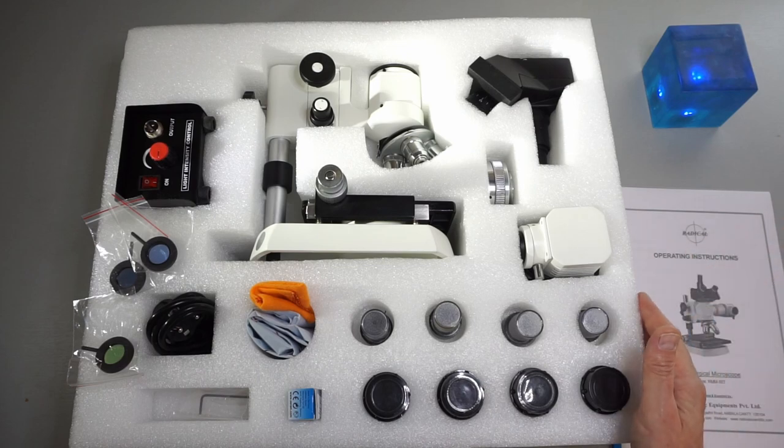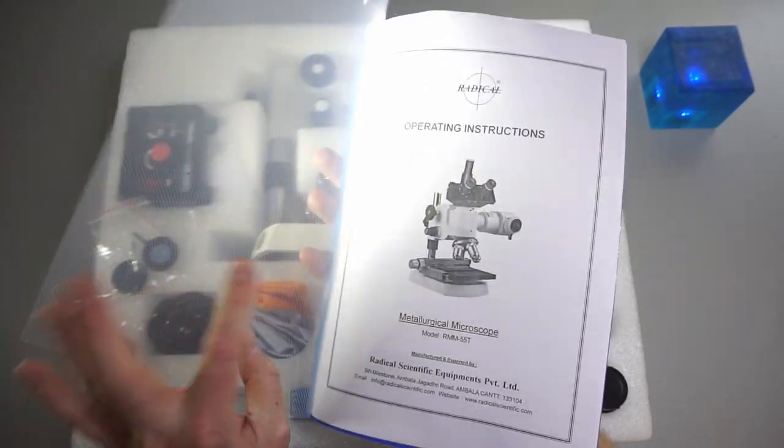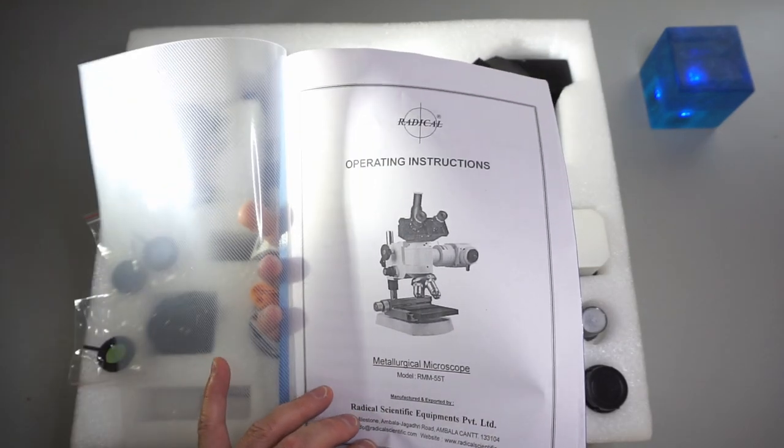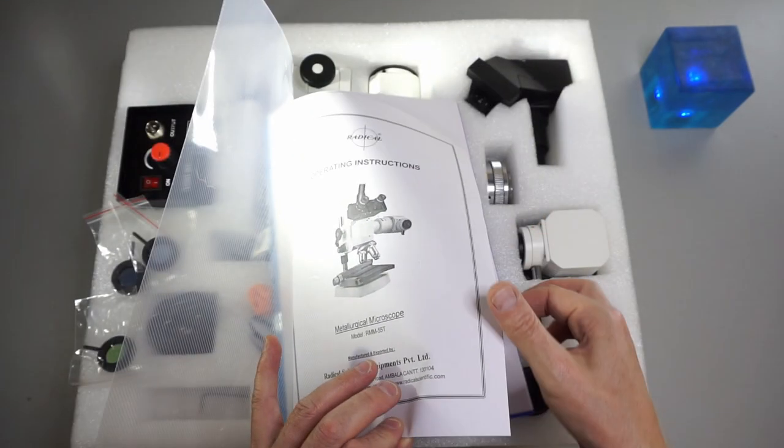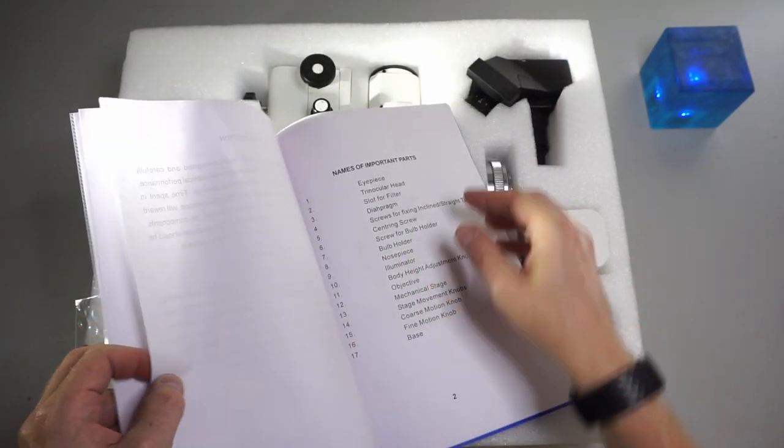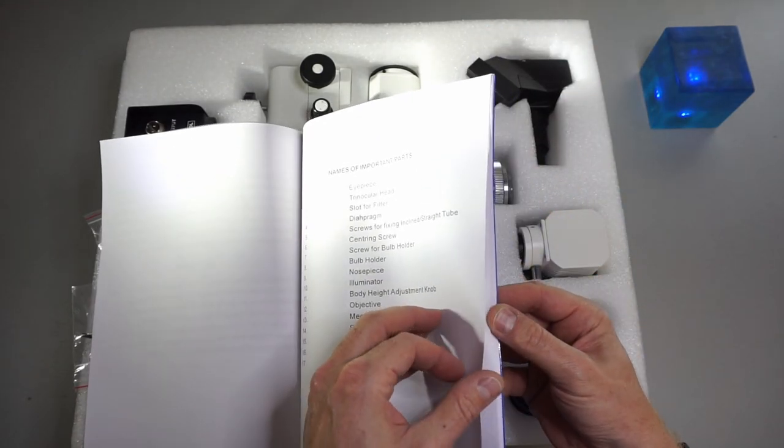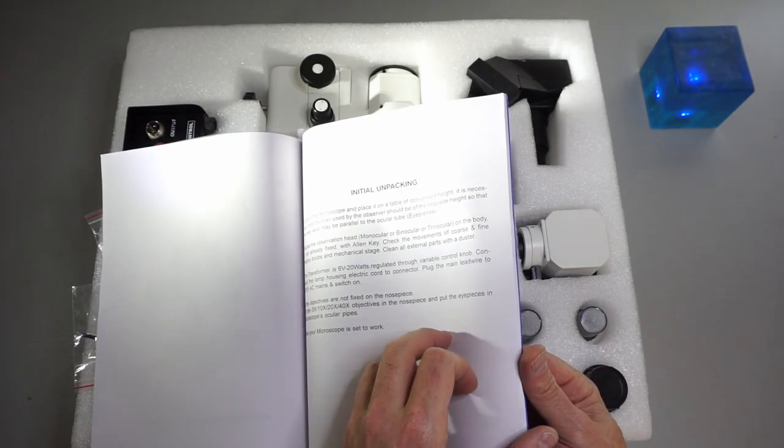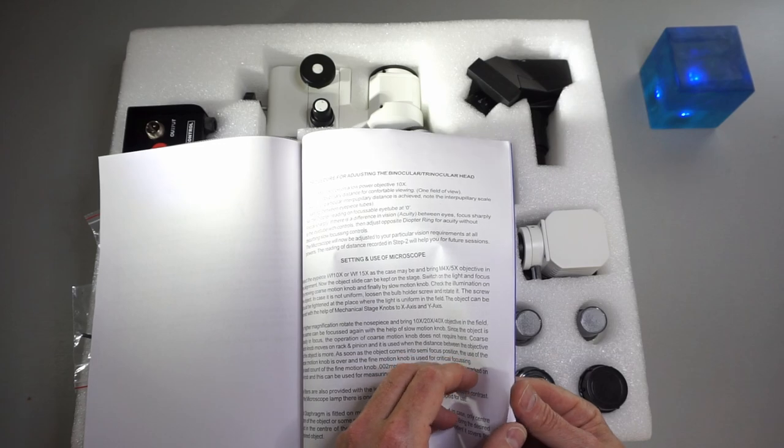Let's see how it looks when everything is set up. Let's maybe have a quick look at the operating instructions. Here's the picture of the microscope in this stage when everything is mounted. The manual is just copied papers, so rather cheap. It describes the important parts.